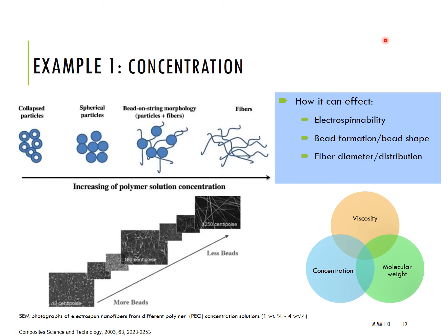One of the important parameters is solution concentration, which can affect electrospinnability, bead formation, and fiber diameter. By increasing the solution concentration, chain entanglement increases, which is important for fiber fabrication. This is an example showing the change in morphology from beaded fibers to smooth fibers by increasing the concentration. It is important to note that viscosity, polymer concentration, and polymer molecular weight are all connected to each other and must be considered together.